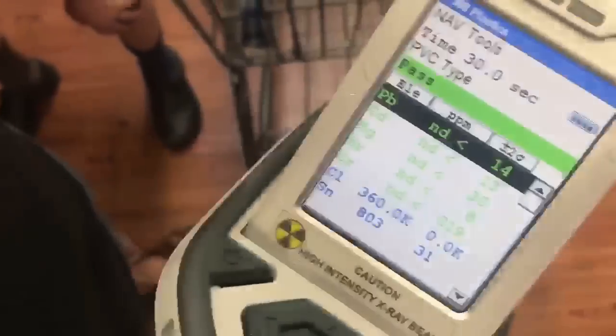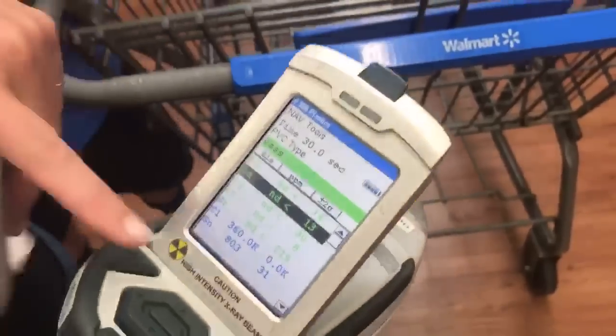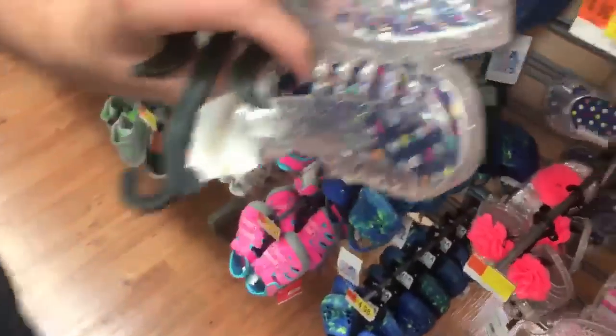I'm going to rest it on the cards to test it. Don't wiggle. We were testing these because of the reported lead results. These are negative for lead — no lead, no cadmium, no mercury. But they have chlorine in them because that's what plastic is made of. We'll test down this one, which is essentially the same thing with a different sole and a different type of design.